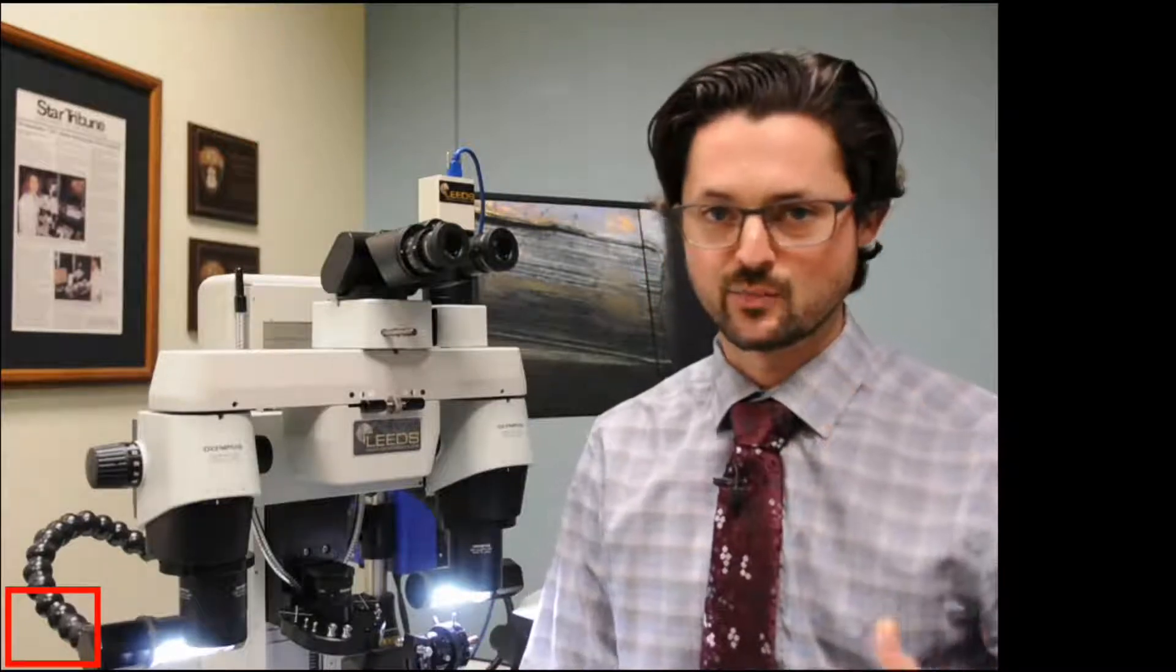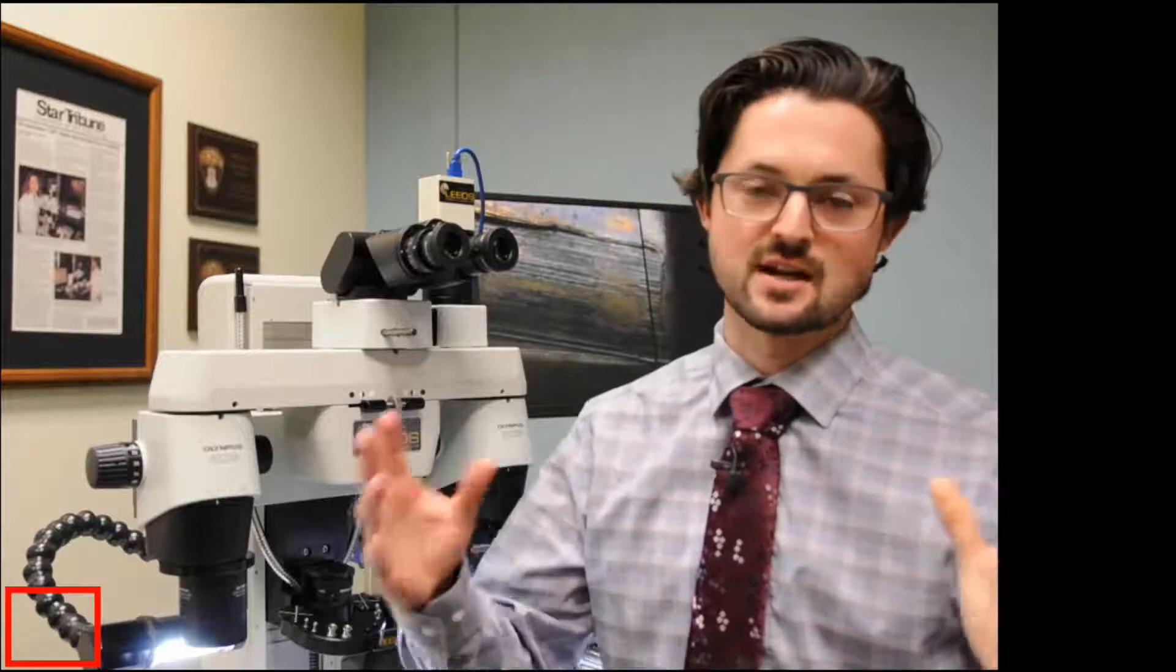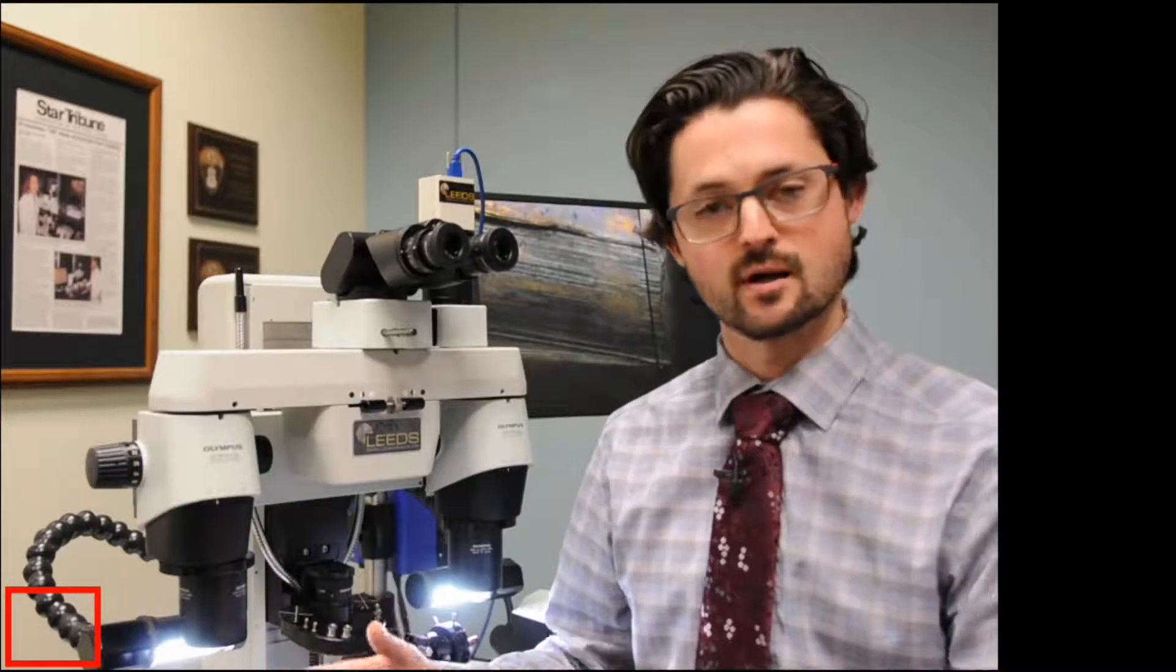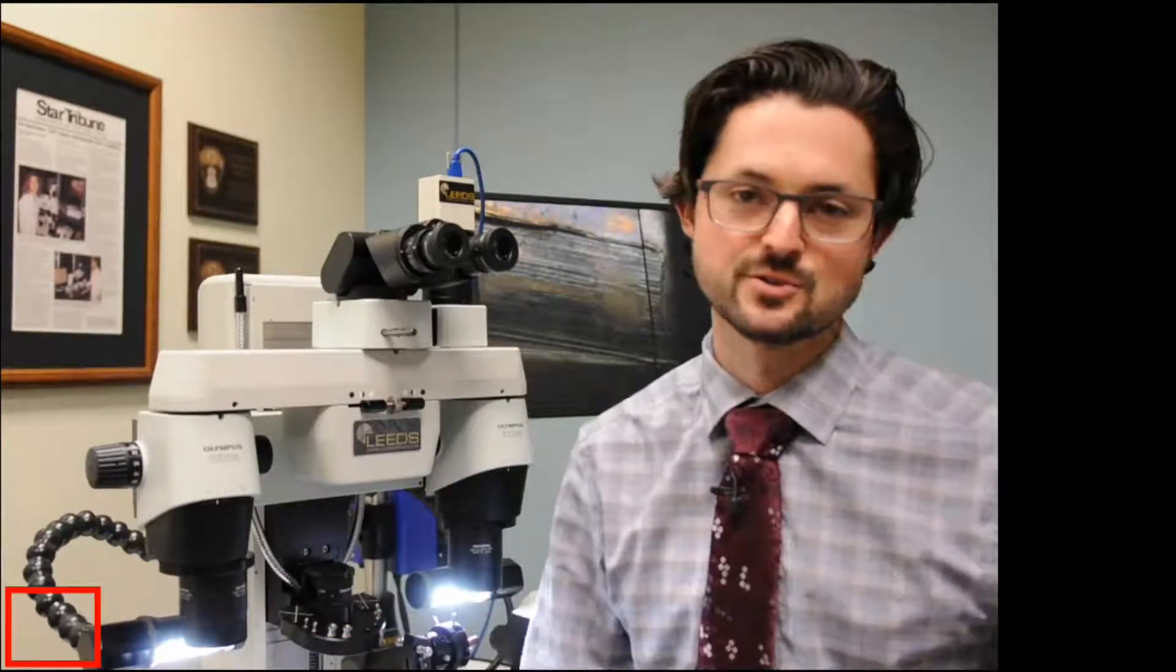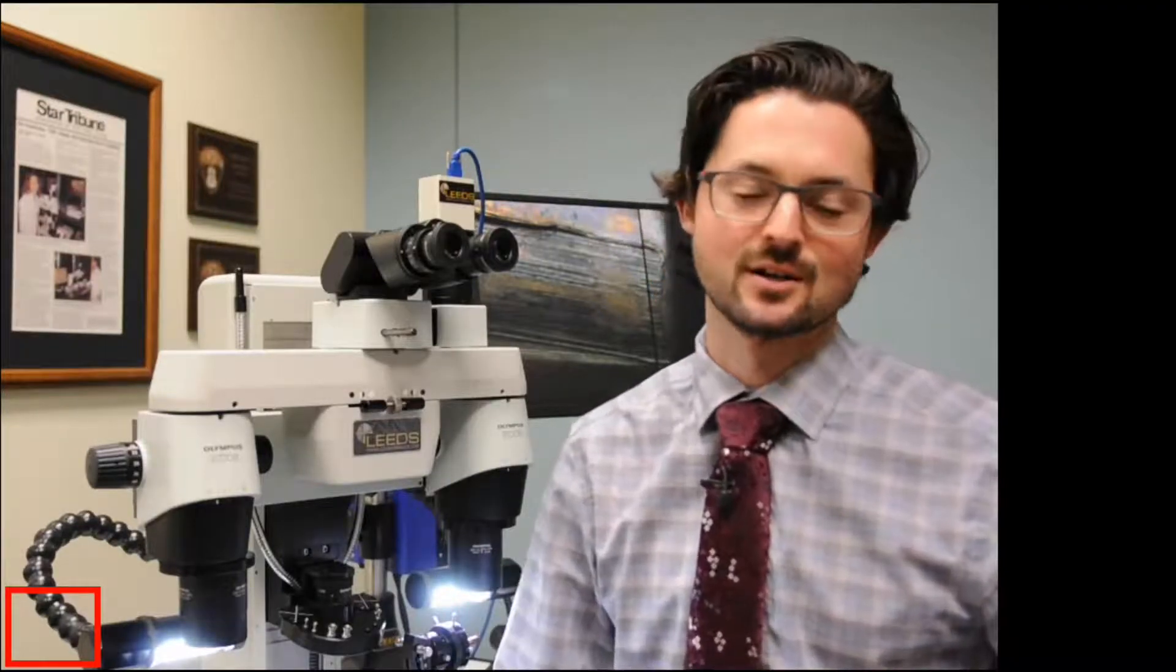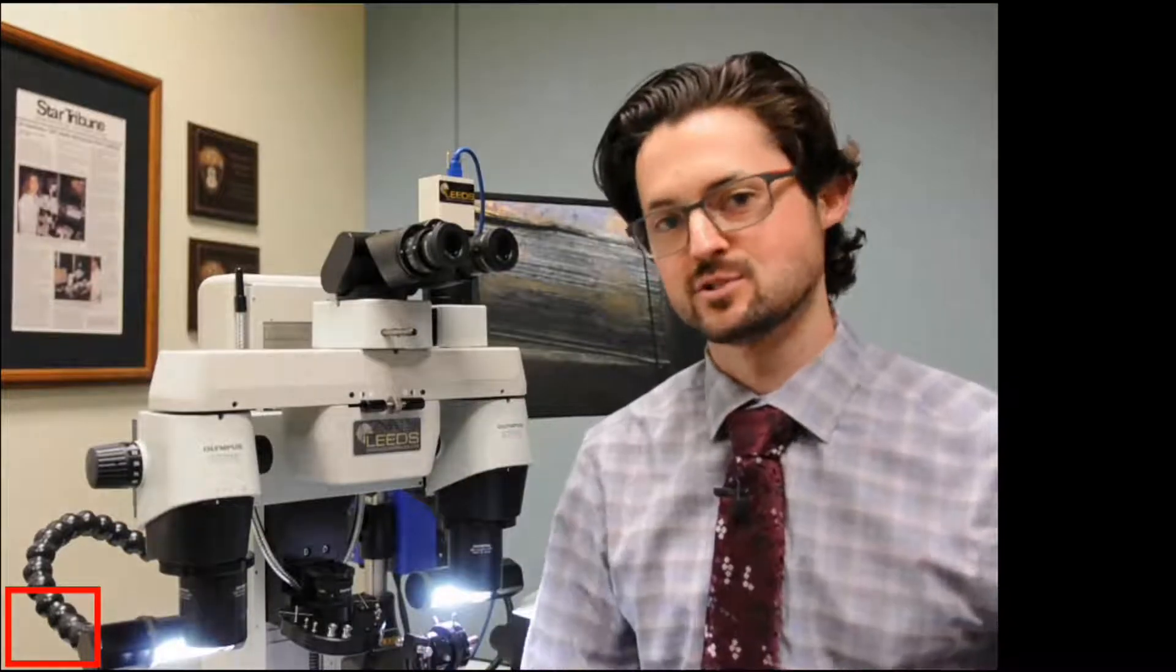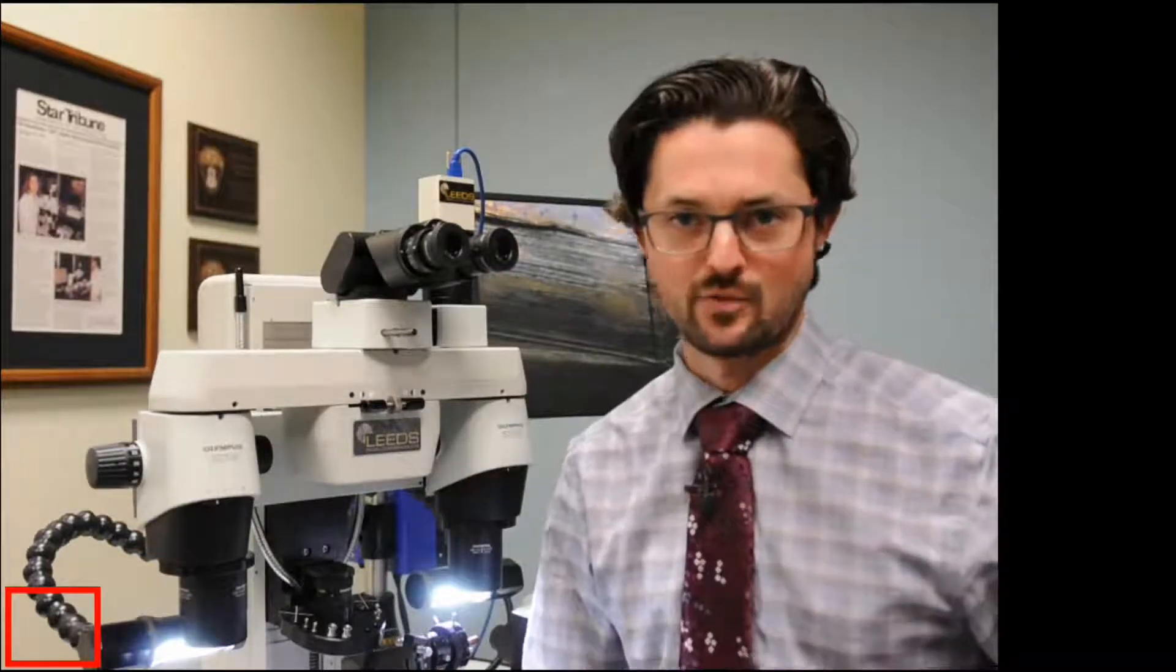Sometimes we'll have things on our spectral vision system, on our EvoFinder system, just various topics dealing with our products, their use in crime labs and forensics, and some helpful tips and hints that help our customers use the products either more effectively, more comfortably, or just in general learning a bit more about the microscope.